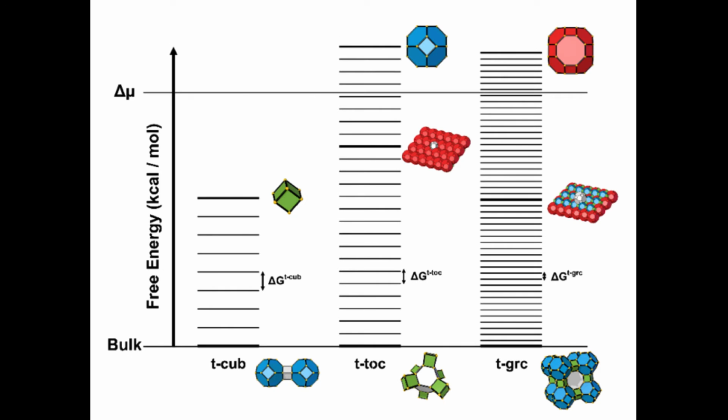And the best way to do this is by actually just running the program, and I'll show you that in a moment, where we run the program to equilibrium and we find where this driving force energy delta mu will drop down and find the balance point of these energy levels. So that's what we'll do now.